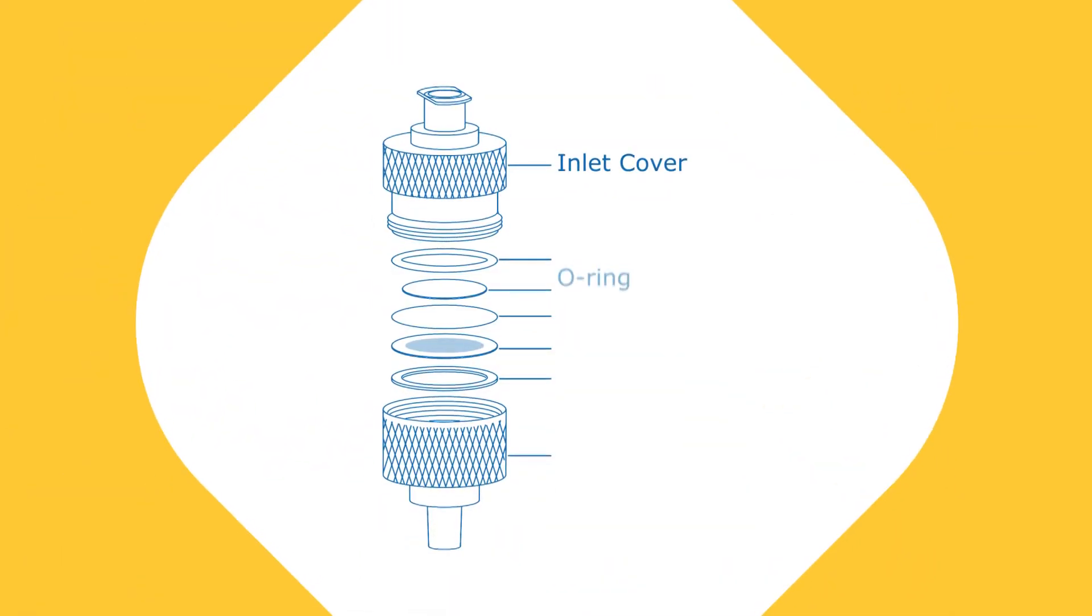Inspect the gasket, O-ring, and sealing surfaces for damage. Imperfections can cause leaks during filtration. Replace any damaged parts.